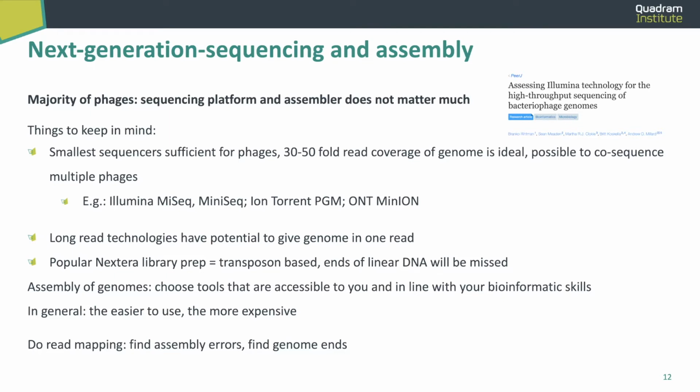Let's call it that. One of the things that I always focus on for people is to do their read mapping, to look at their genomes, to find assembly errors, find genome ends, and we will show you a tool to do this today.